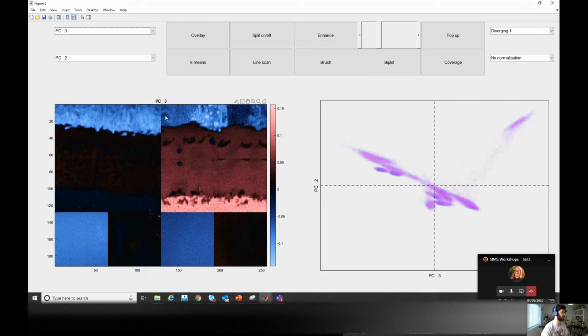But it's interesting to see that it relates to the top surface of both samples, and these references are actually my uncured, if I'm not wrong, I forgot which order it is, but I think it's the uncured materials. That shows that on the top surface my material is more uncured. Maybe it was the cured, but you get the idea.